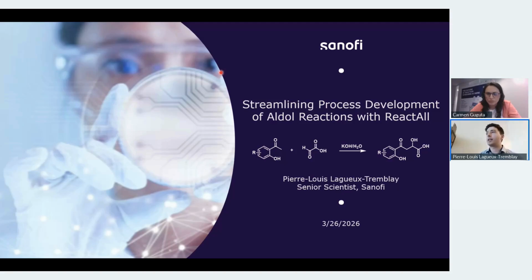However, I know that once in a while there could be issues if you have small particles, they could get aspirated and it could potentially get to a clog. And this didn't happen very much. However, recently, I think Technobis is working on having some filters.